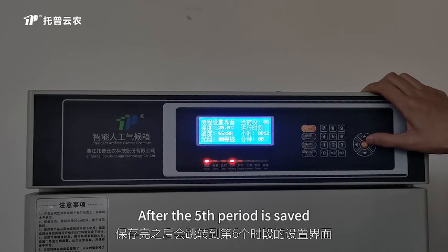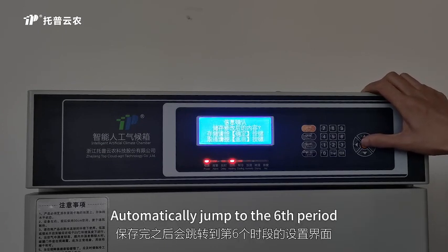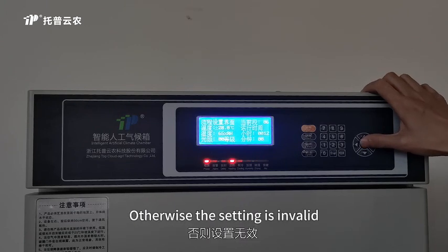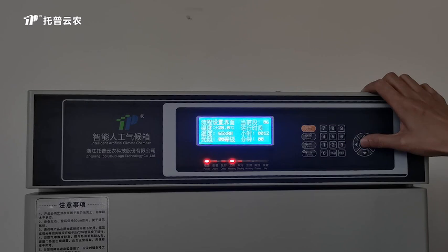For example, set 5 time slots. After the 5th period is saved, it automatically jumps to the 6th period. At this time, long press the OK button to run. Otherwise, the setting is invalid.